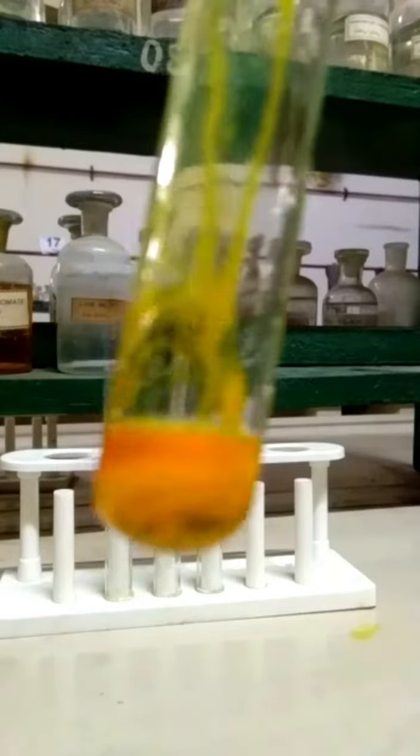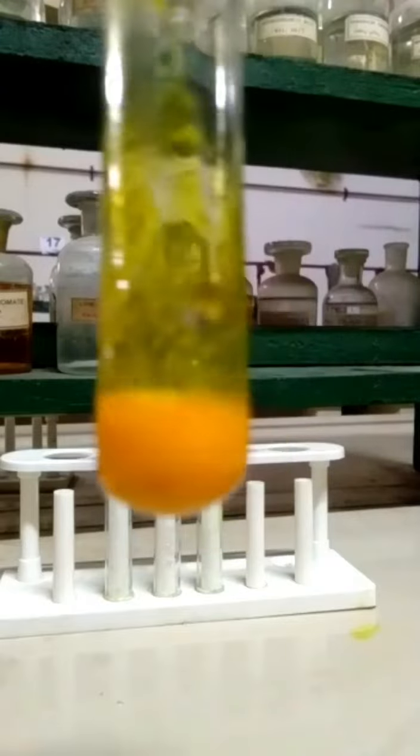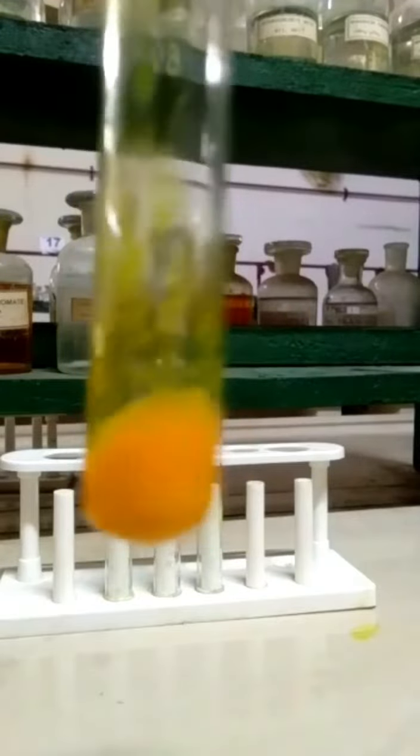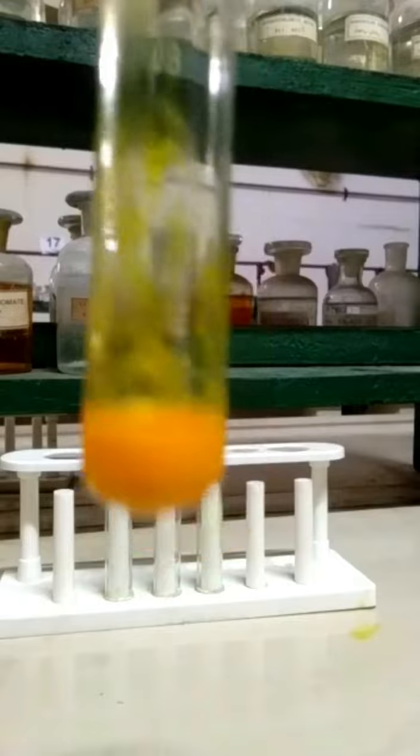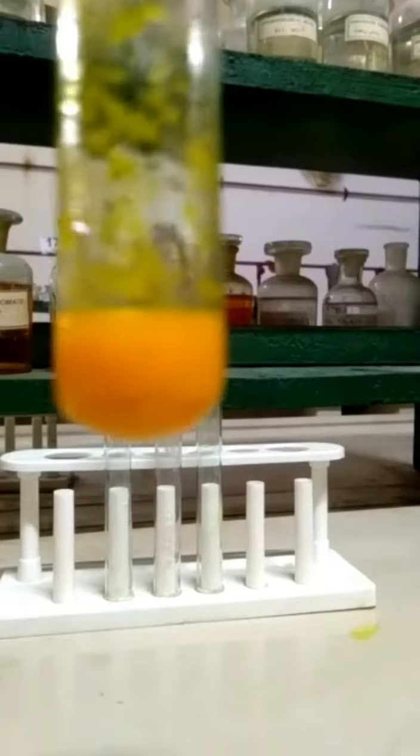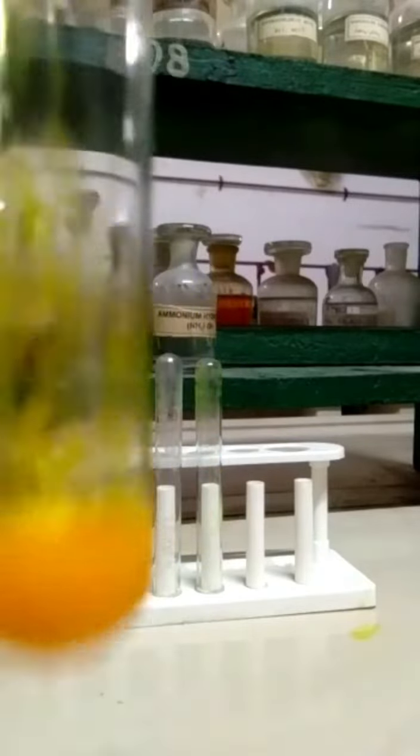Yellow-orange precipitate will be obtained, which confirms the presence of carbonyl group in the given organic compound. Here I have added an organic compound, which is acetone, into the DNP reagent and yellow-orange precipitate was obtained.